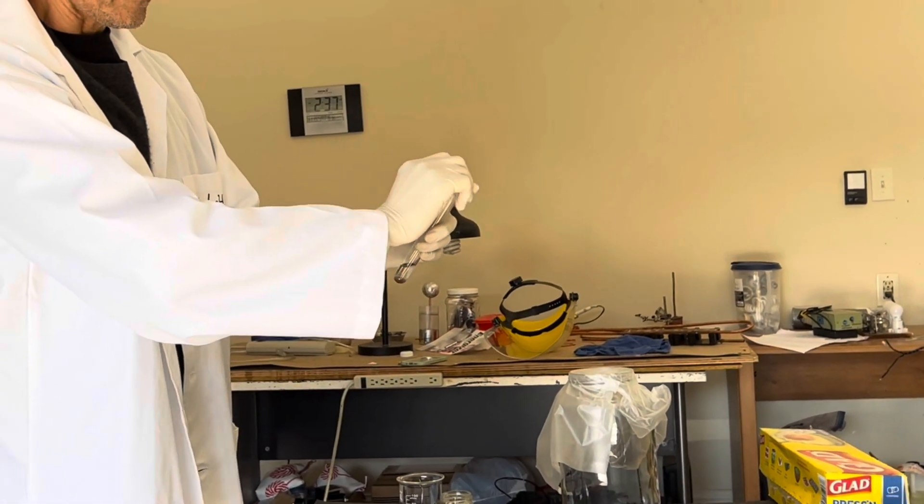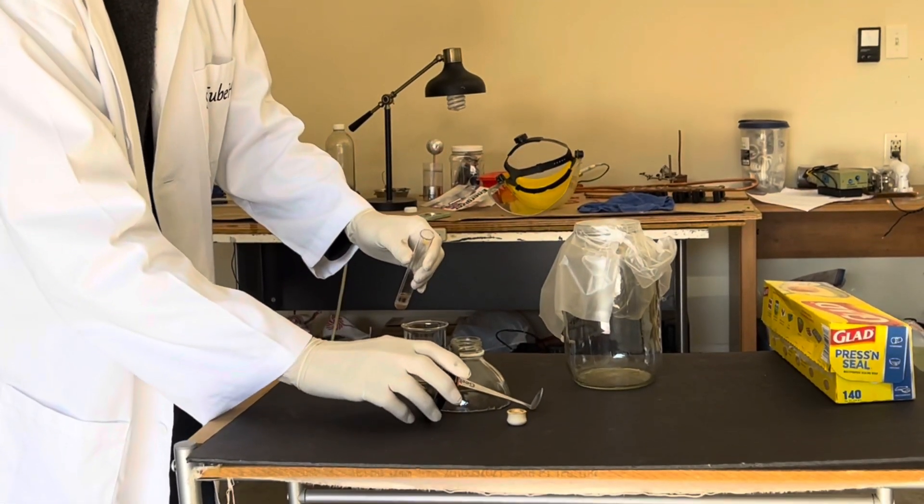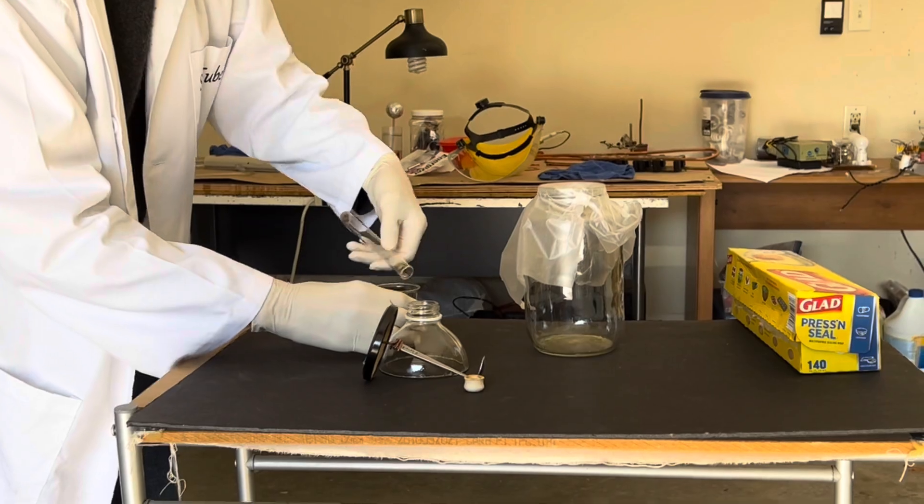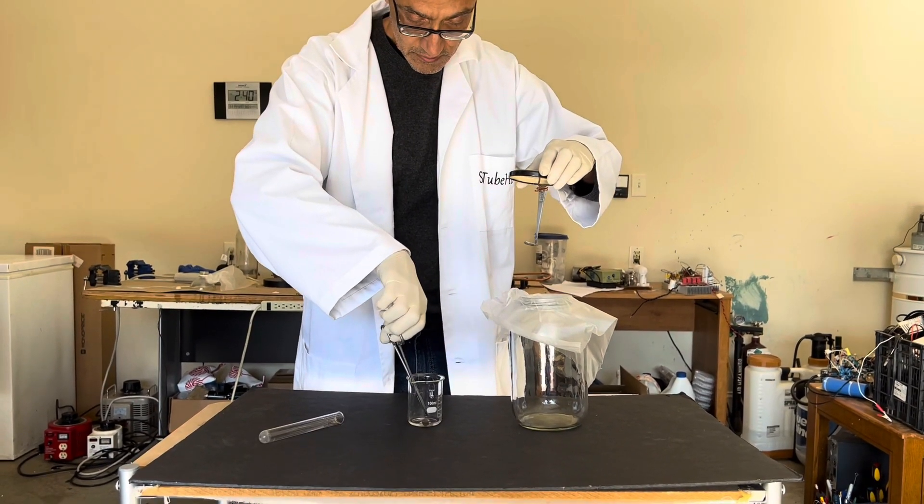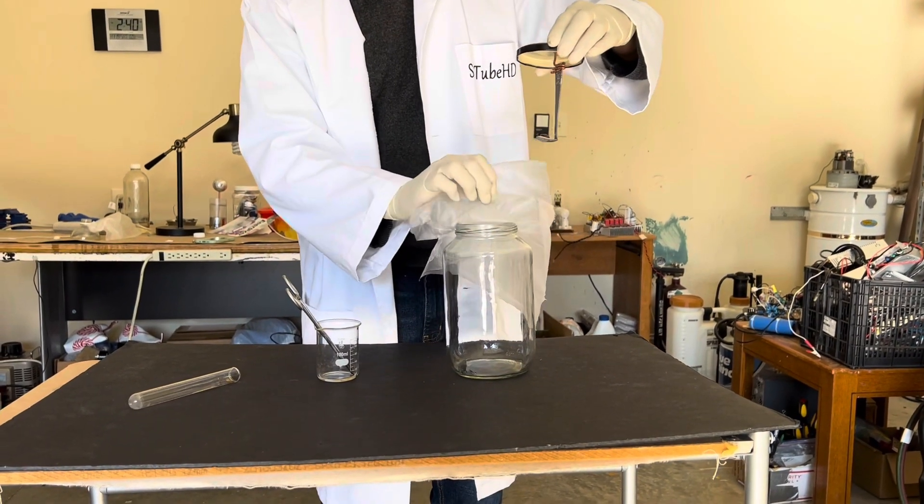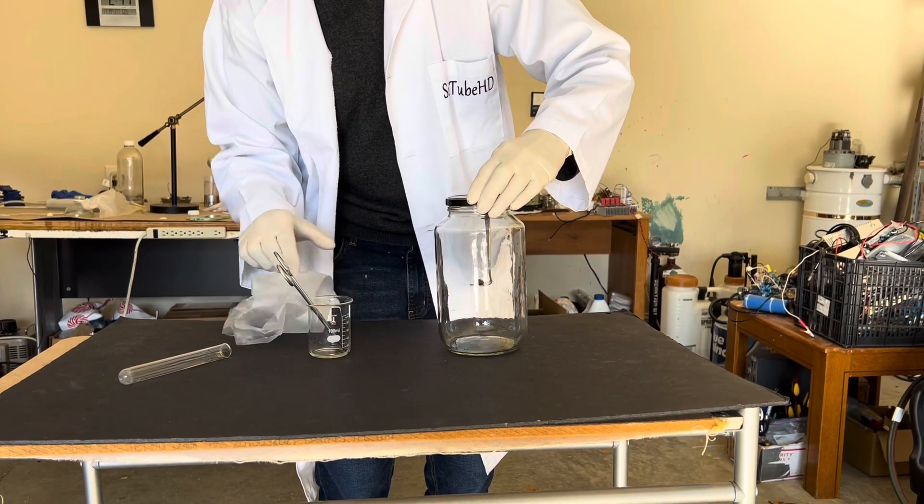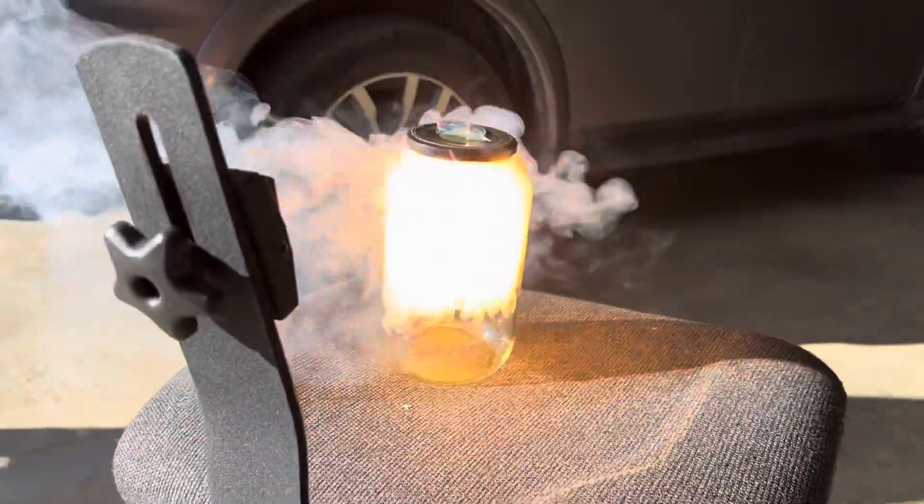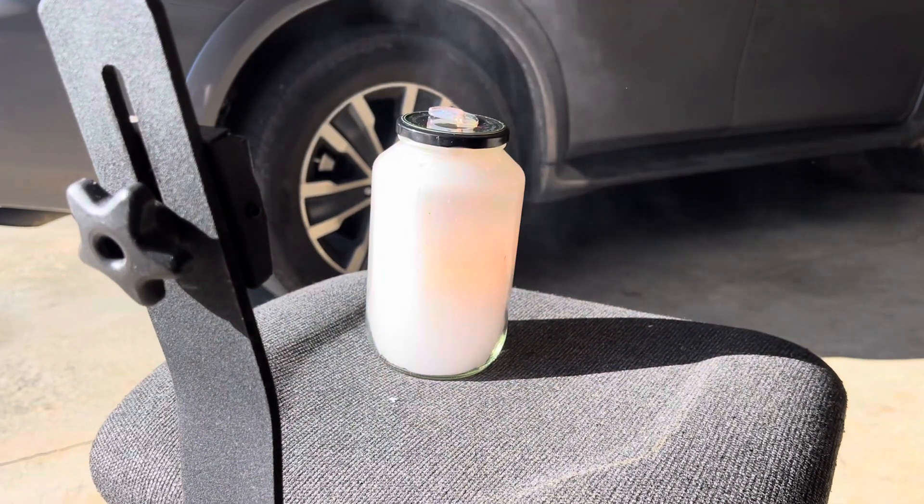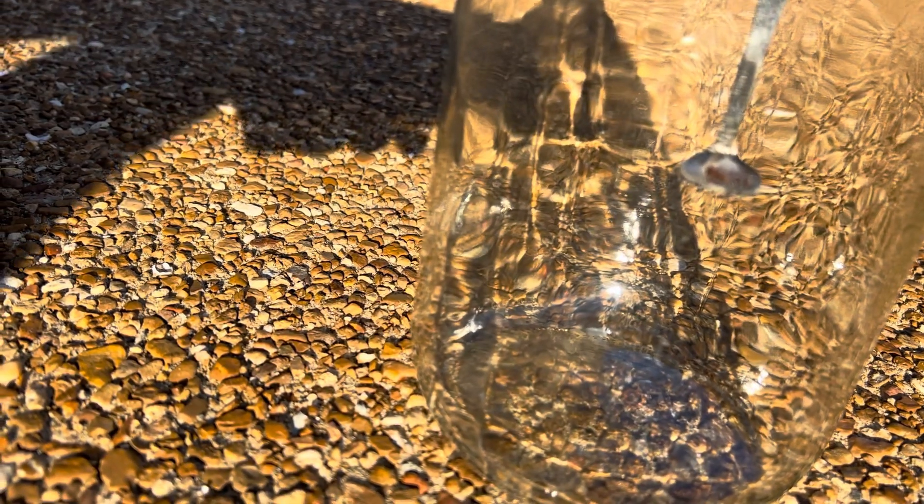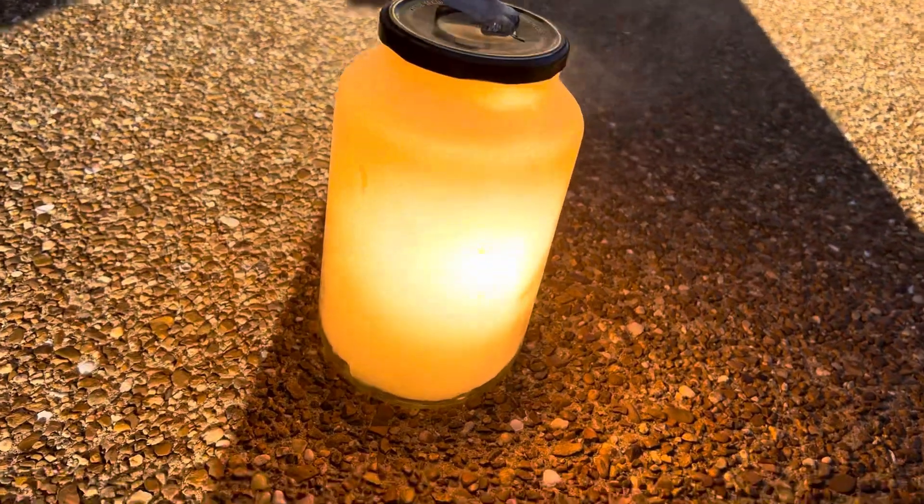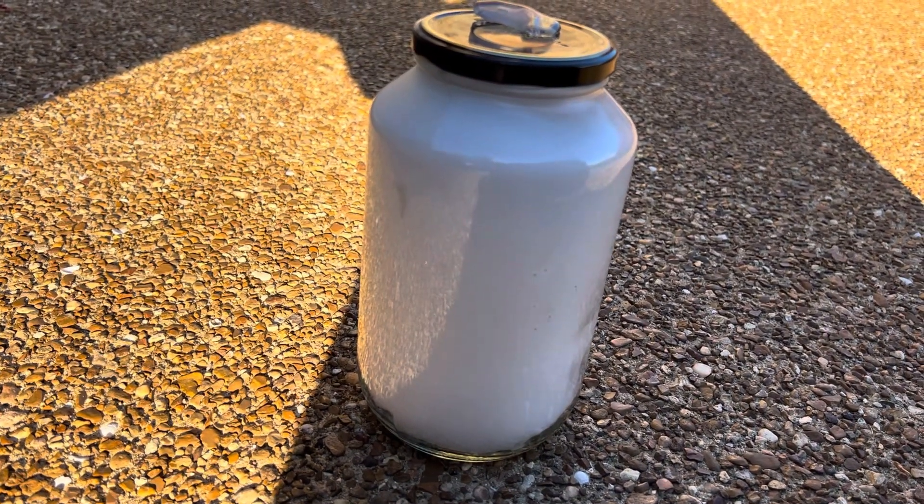What we're going to do now is pour off the water from this phosphorus into this beaker, and place a piece of phosphorus on that spoon. I need to take this outside quickly as it's going to ignite spontaneously.